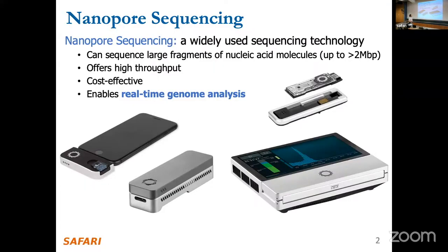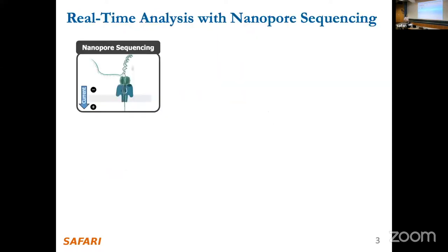So let me start off with some background. This goes in the same direction as this raw hash work that John presented recently. So I'm using some of John's background slides here. So recall these nanopore sequencers. They're kind of these tiny devices. They're mobile, and one interesting bit is that it enables real-time analysis of the data.